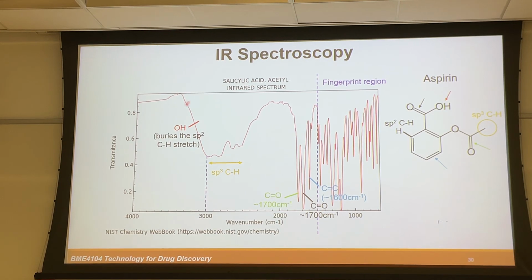And even further on the left, if we see it at about 3300 or higher, we can have in mind that probably we have a triple bond CH stretching. And of course, we need to look at the 1700 region to look for those very sharp carbonyl peaks as well. Okay, so that's the most characteristic peak we should be looking for, from the beginning.